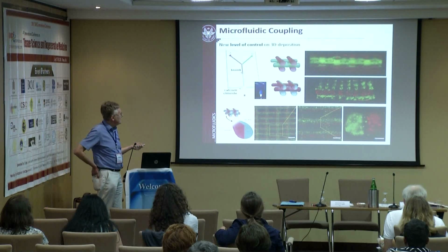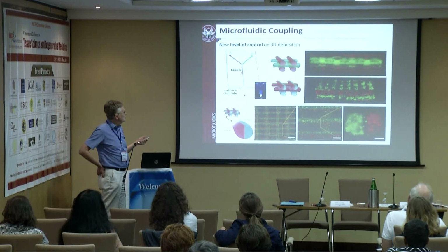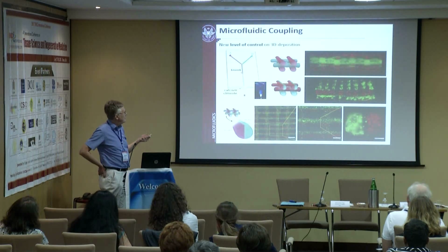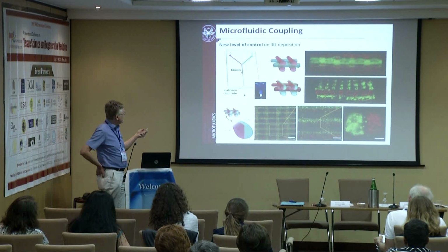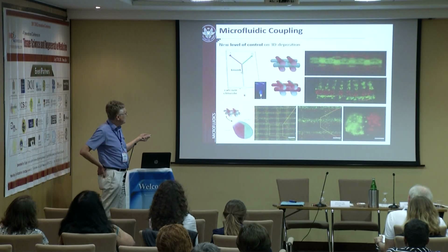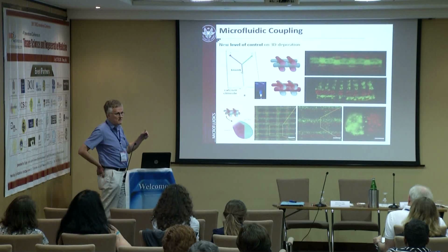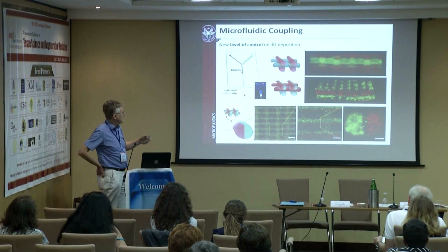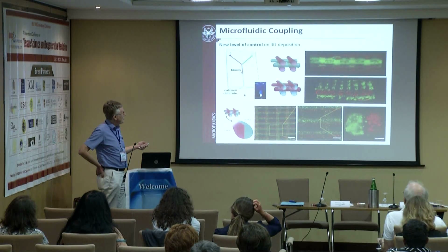We used 2 bioinks consisting of alginate and containing red and green labeled fluorescent beads. And as you can see, if we send alternately the 2 bioinks to the extrusion system, in this way we print a scaffold characterized by alternate layers of different composition. Or we may also send simultaneously the 2 bioinks to the extruder, in this way printing a composite fiber.